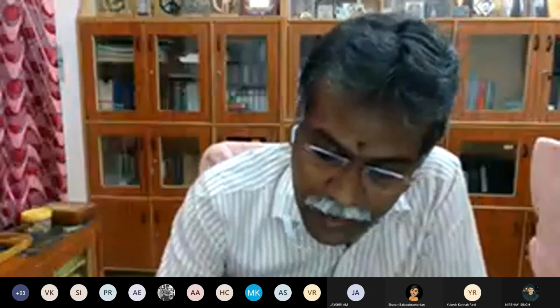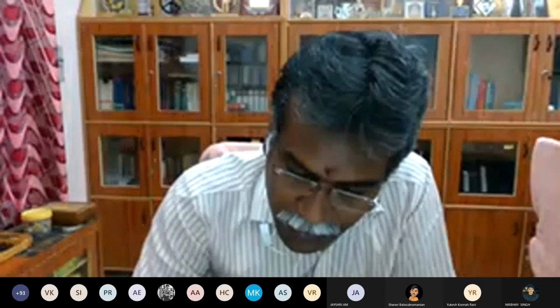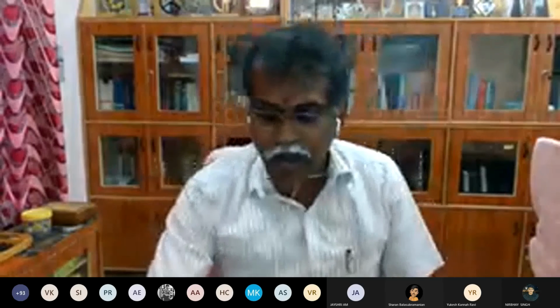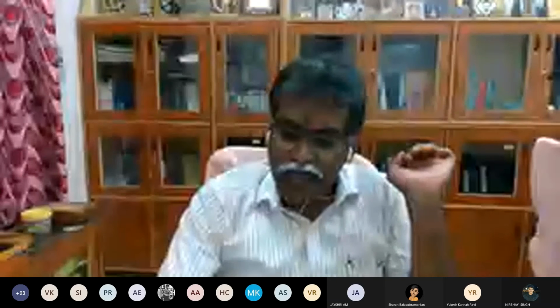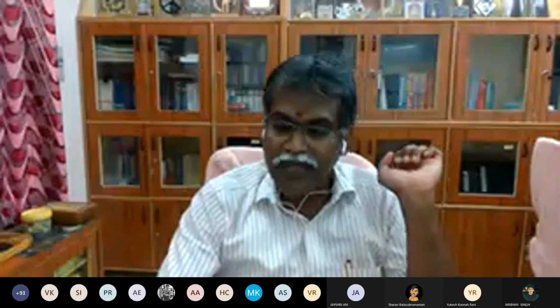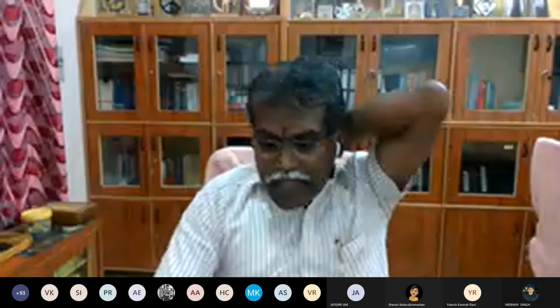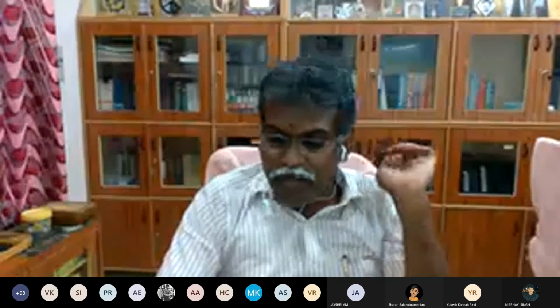So in turbidity measurements, you have to calibrate the instrument with a standard NTU as well as distilled water. Distilled water, this turbidity-free water, should show 0 value, and this standard NTU you have to adjust with the calibration knob. Is it okay? So you can see 4 knobs. One is for range, another is for calibration, and these are for setting 0. One is for maximum adjustment, which we call coarse, and the other is for fine adjustment. If you want to adjust coarsely, use this knob, and if you want to adjust very finely, use this knob.